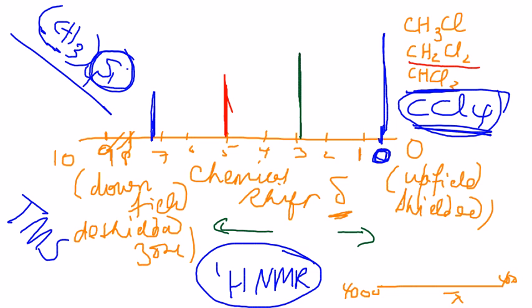So you would be missing out on a lot of signal if you auto zero that. That is why they chose something which is more electropositive, and of course it's volatile as well. So after you're done, you can just evaporate it and get rid of that TMS. So that is the internal standard that we use.